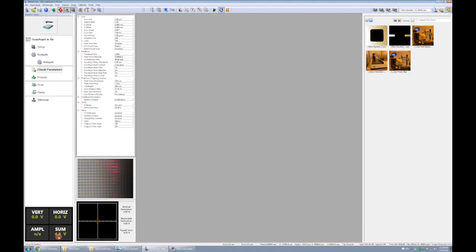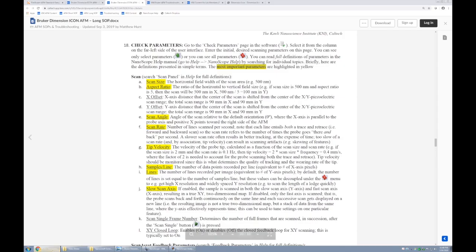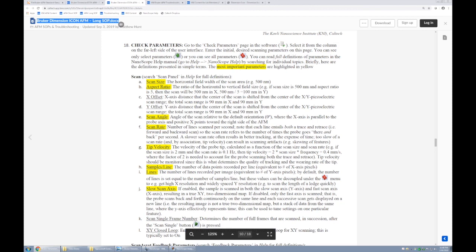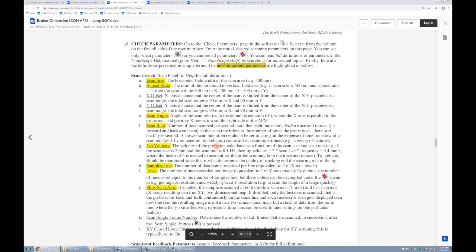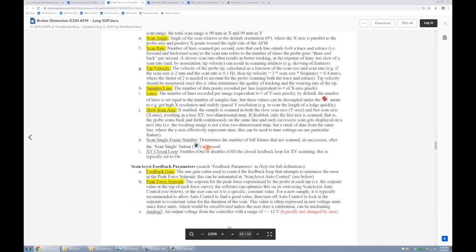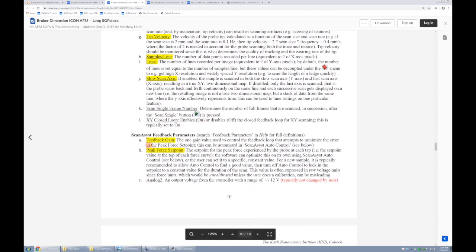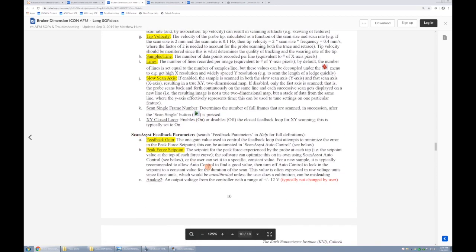At this point, I'll also take you over to the long version SOP that we have. Here is where I've collected definitions for all of the parameters involved on this system. Here are the basic ones up top. I've highlighted in yellow the ones that I feel are most important, although certainly you can read up on all of the parameters.